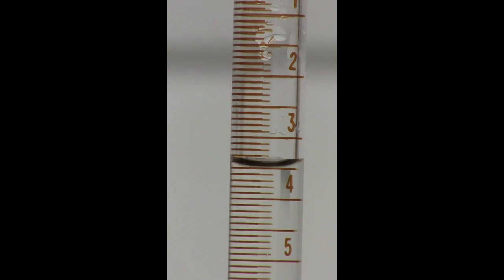You'll notice that the buret is numbered from 0 to 50, starting at 0 at the top. That means when we want to read the initial volume, we'll have to read it from the top. So right now, the current volume is at more than 3, almost 4. And when we record the starting volume, we do it to 2 decimal places. Marked out on here is accurate up to 1 decimal place. The second decimal place we'll have to estimate. So right now, what do you think the volume level is on the meniscus? It looks to me to be about 4.00. And remember, that second decimal place is an estimate, but the first decimal place we do have confidence in.